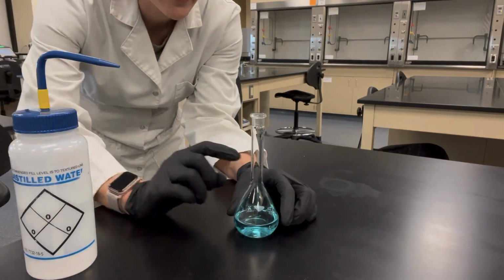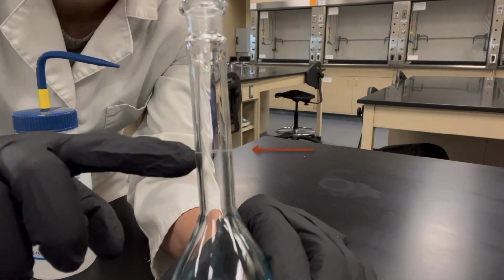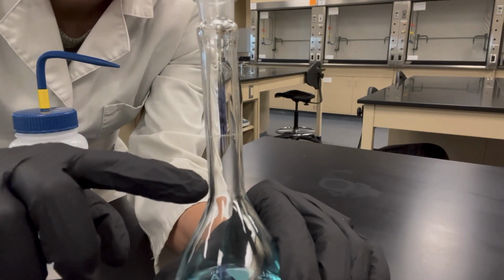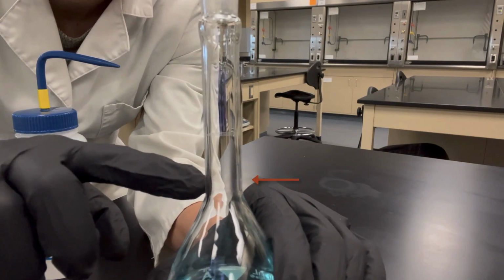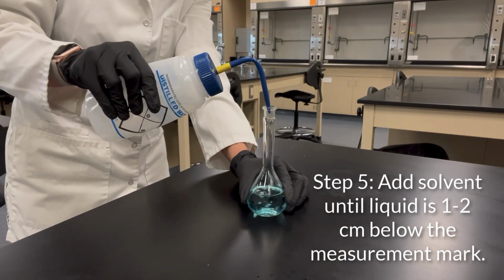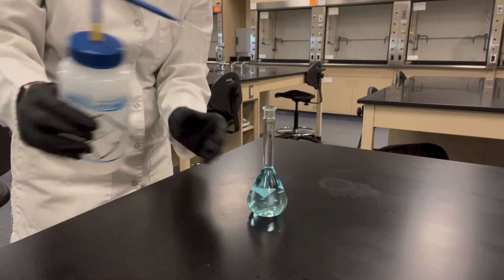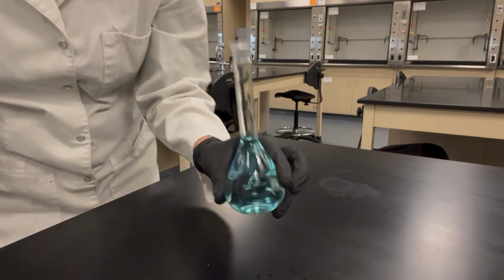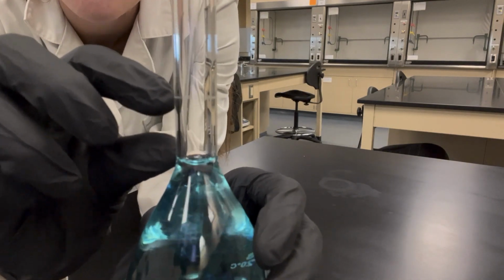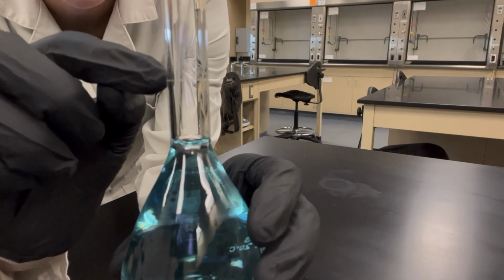Make sure you know where the measurement marking line is. On this particular volumetric flask, the measurement mark is right here. So I'm going to fill this with the solvent a couple of centimeters below that measurement mark. I've stopped filling here a couple of centimeters below that measurement mark because it's very important with volumetric glassware to not go over the measurement mark.